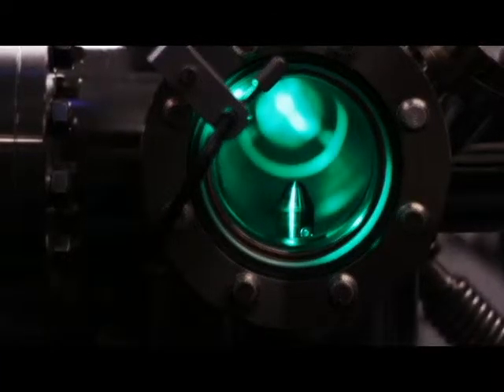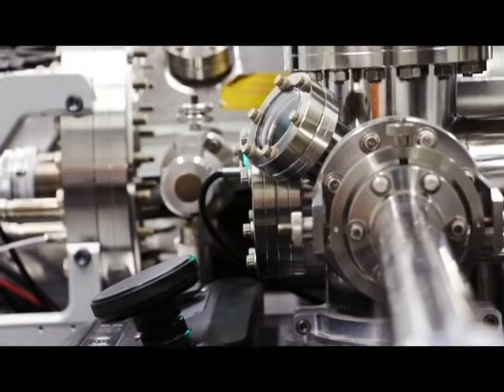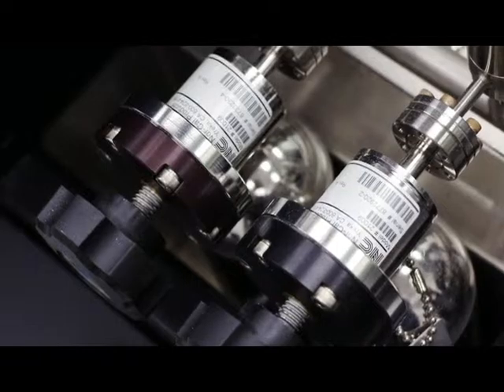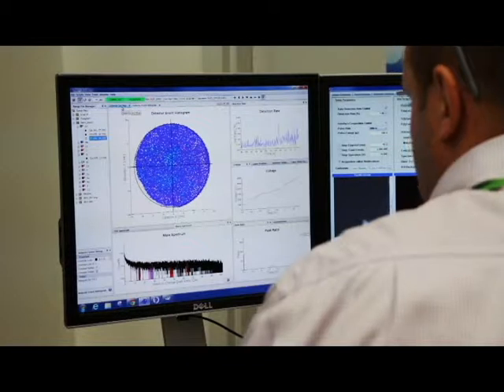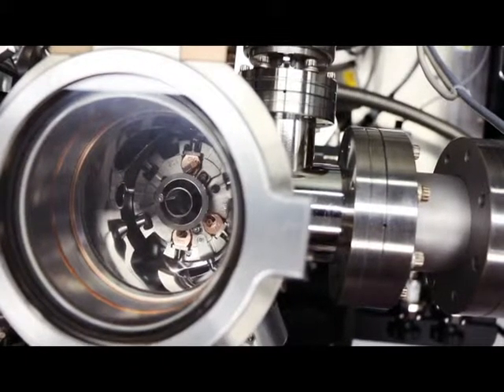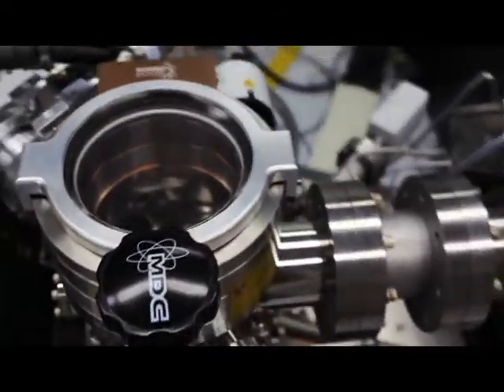In particular we look at a lot of nuclear materials, so a lot of steels for nuclear reactors. We look at cladding materials of nuclear fuel, so the zirconium alloys. In particular there we're looking at oxide formation, interfaces, etc.